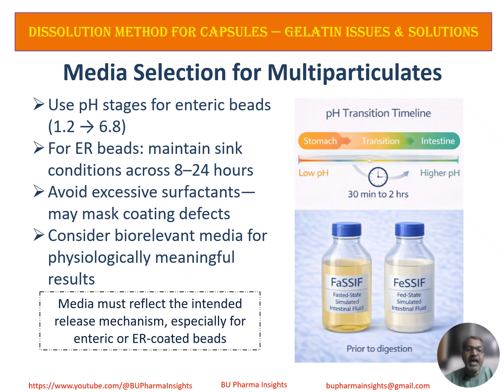Important cautions: avoid excessive surfactants, they can mask coating defects. Use biorelevant media when needed for physiologically meaningful results. The goal is simple: confirm the coating performs exactly as designed. No early release, no dose dumping, and controlled delivery.